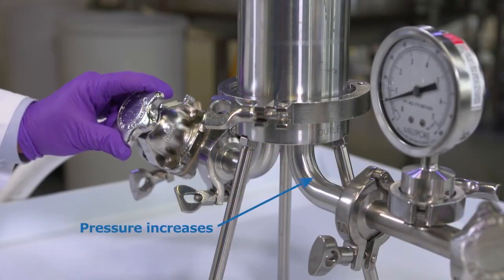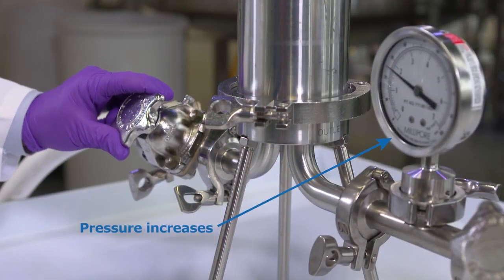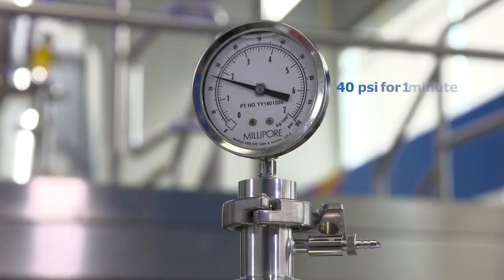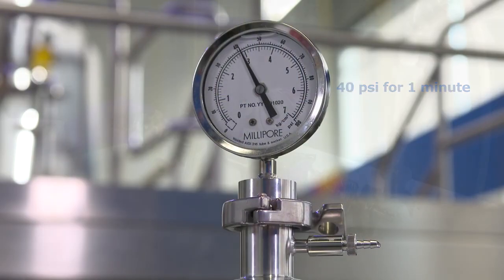With the outlet closed, the pressure in the housing will increase to whatever pressure is available at the inlet. Generally, we target 40 psi, but whatever pressure is available will suffice. Let the system stand at this pressure for one minute.